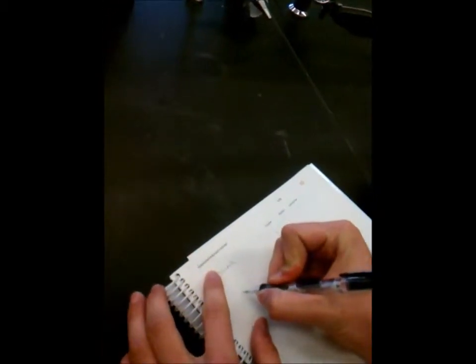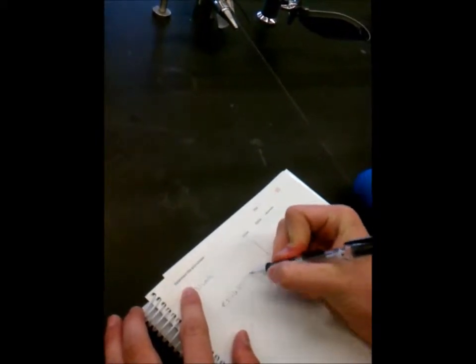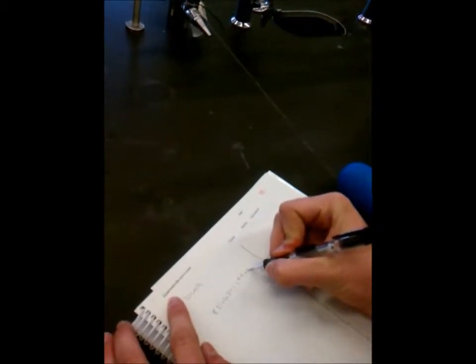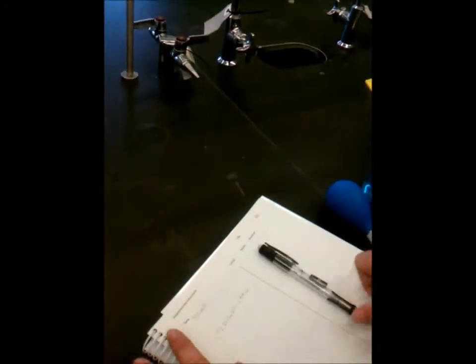Initially, my final volume was 8.21. I subtract 6.27 from that to get 1.94. And that'll be in milliliters. And then that's how you measure with a pipette.